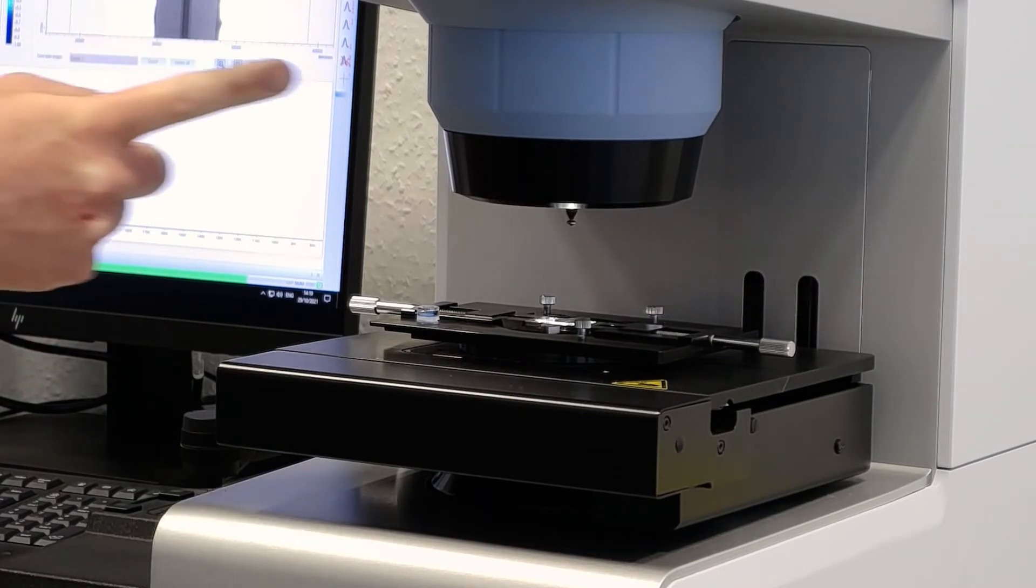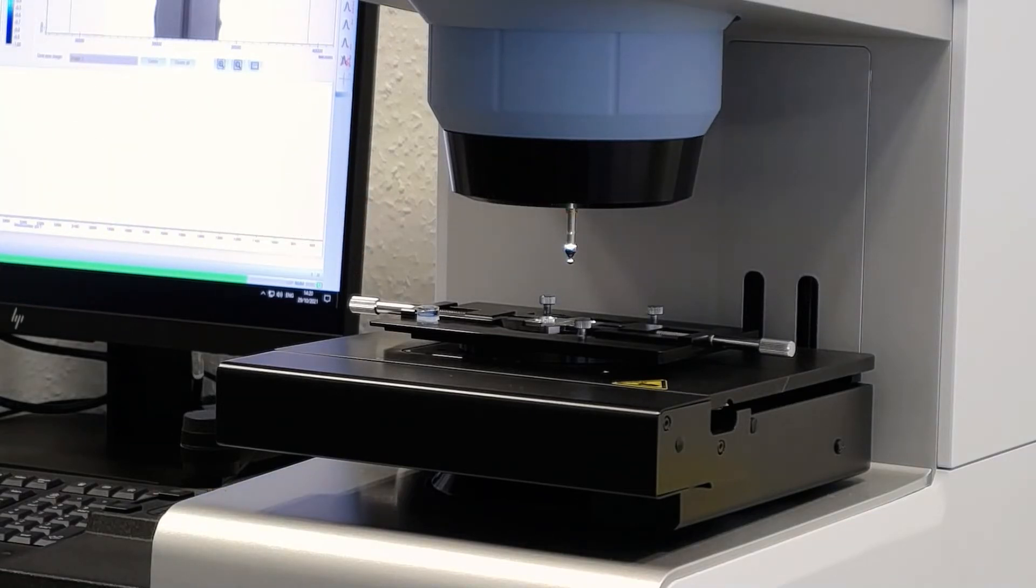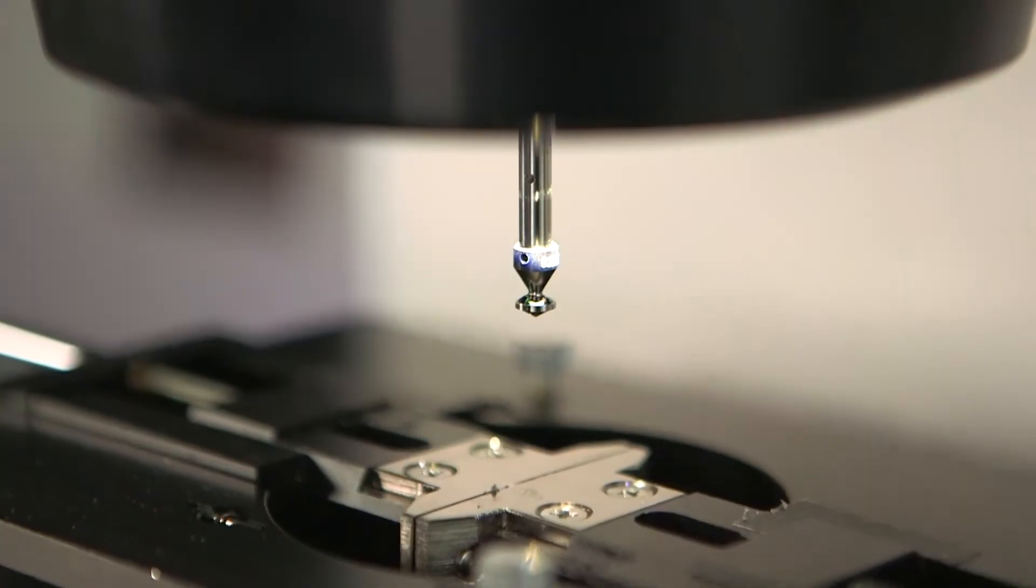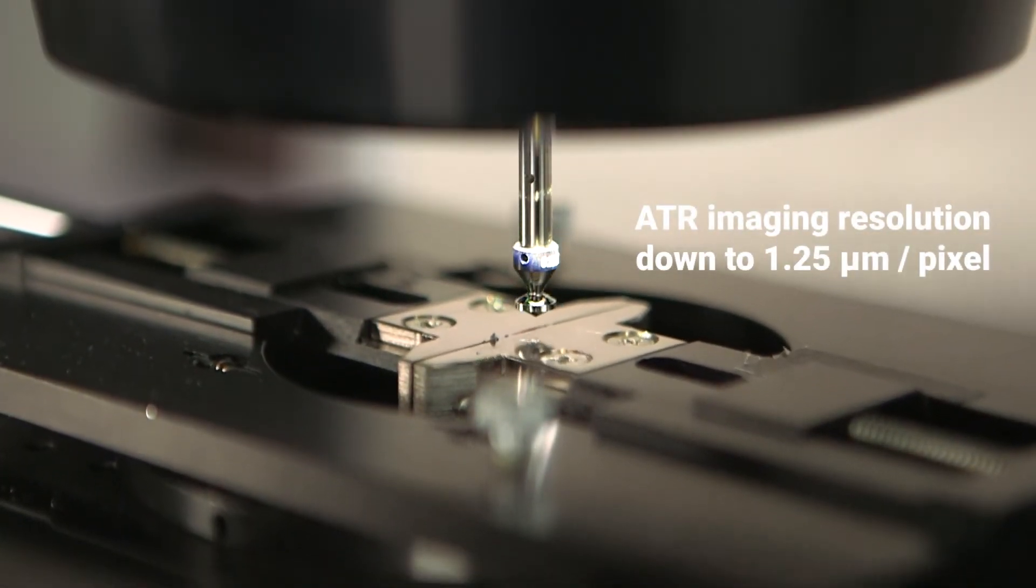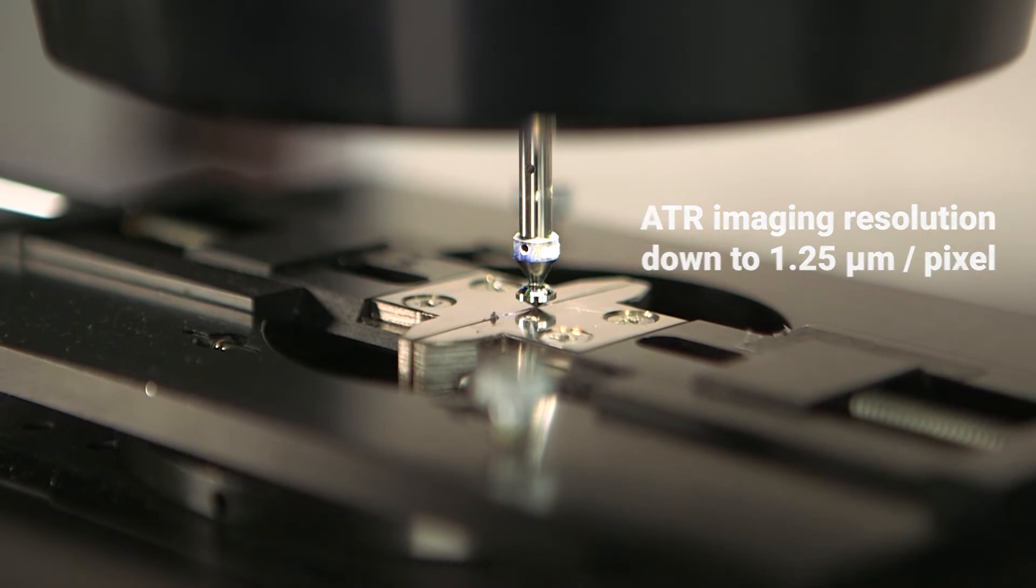Using ATR imaging, we analyze the layers with a spatial resolution of above one micrometer. The combination of true FPA imaging and automated ATR enables pristine high resolution material characterization.